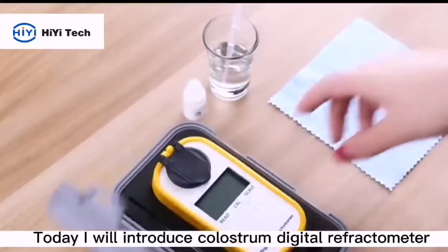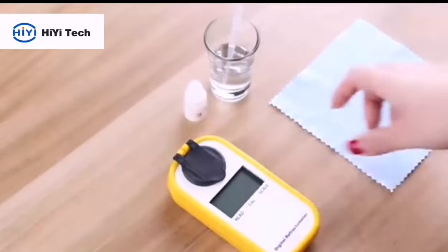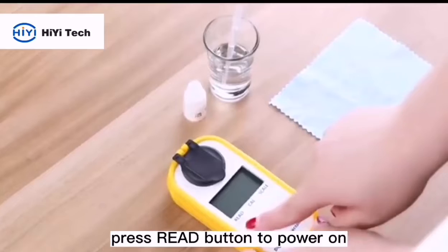Today I will introduce the colostrum digital refractometer. Press READ button to power on.